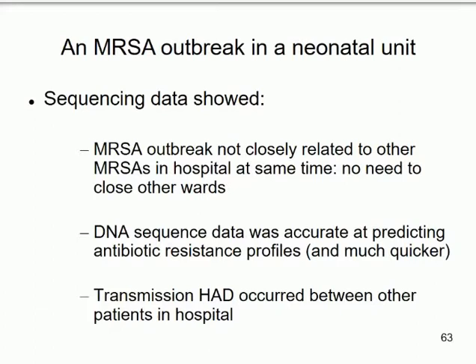And that's an important thing if you're a hospital manager, because obviously closing down wards is a major undertaking. It also turned out that the DNA sequence data was very good at predicting whether or not these strains were antibiotic resistant and what they were resistant to. It was a lot quicker than doing a standard resistance profiling experiment. So that's very important for the doctors who want to treat.